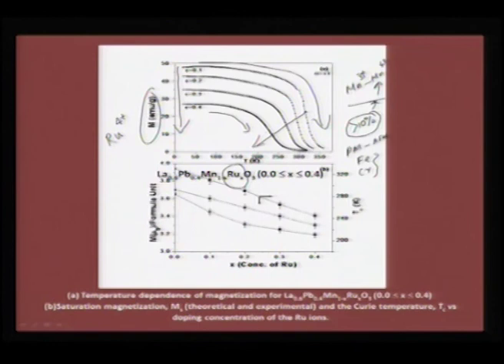Why I am particularly emphasizing this here is, when you consider a unit lattice of manganese and ruthenium, for example, ruthenium 3+, manganese 3+ and manganese 4+ are there. If you are increasing the proportion to 40%, we are saying at every alternate position next to manganese, we are almost bringing another ruthenium. So, in a basal plane, the AB basal plane, where we have manganese and ruthenium, we are almost evolving a new perovskite phase, and this is not known or reported so far.